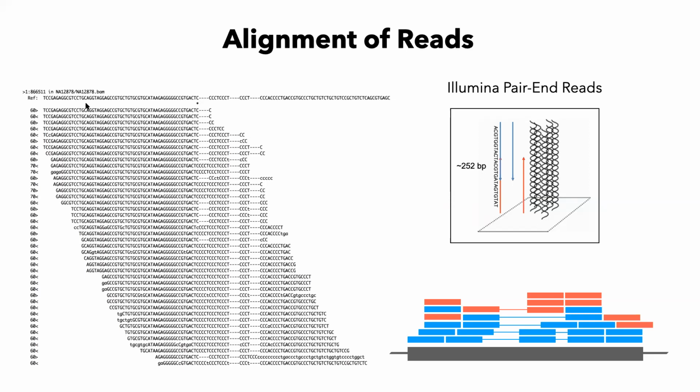Essentially, what that means is that we have individual reads. Those reads have to be identically placed on the reference. And then we have a collection of reads, and they might have some overlap, they might have less overlap, and they might have a complete consensus. In other words, they agree completely on the full sequence, or there might be some variation that we think might be a result of different types of technical or biological differences.